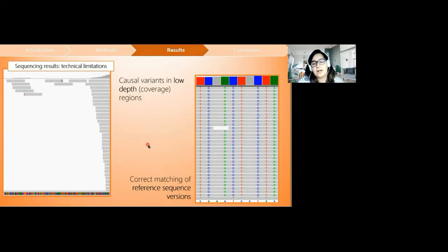The usage of an alternative reference sequence in a case specifically where the causal variant is in the mitochondrial DNA was another source of failure, as seen in the right image. So a mitochondrial causal variant may entail problems with the used reference sequence where variants can go unnoticed. This is something to keep in mind when working with this kind of data.